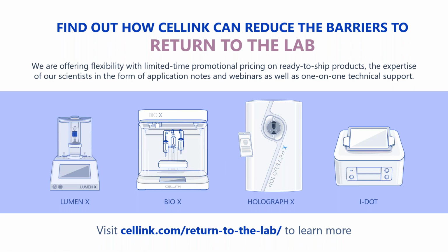Sorry, Charles, one more question before we go. This person would like to know whether there is any other function to control culture conditions, for example, pH control, feeding more liquid, and so on.